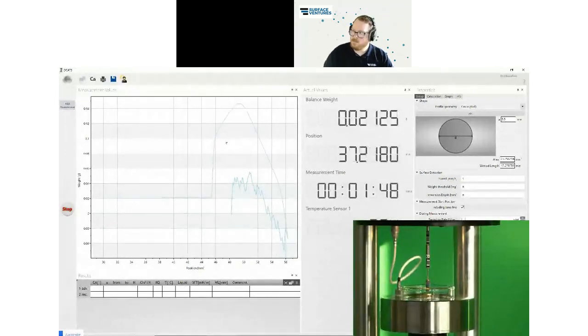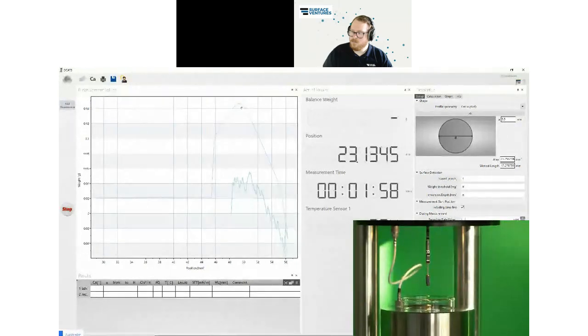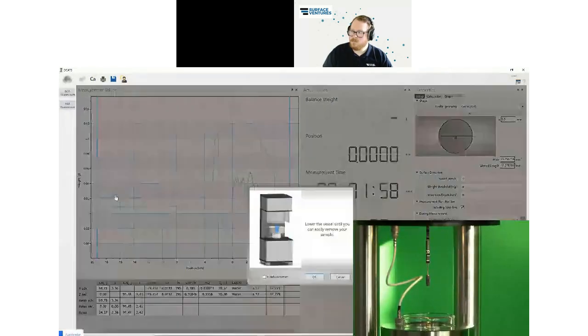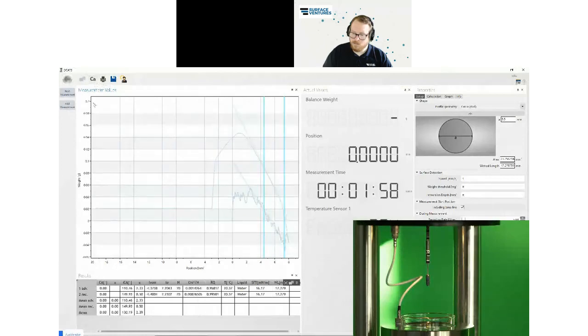Good. This was the first step of the measurement, and now we would do the result evaluation together. As you have seen, the implant is a bit conical, so the very upper part and the part at the beginning we will not take into account. So we take our trigger lines and blind out what is happening at the beginning, because this is where the implant is not straight, where it's conical. The lowest part we also take out a little bit, and now we do our calculation.